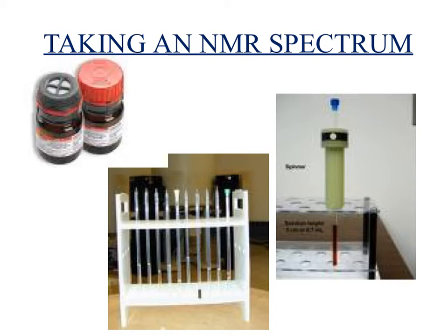Hi Year 14, the first thing that we have got to do before we talk any more about NMR is get the sample that we want to run in the NMR machine ready. Now if you look at the middle image there, you'll see that there are lots of little long tubes, and this is what the sample is placed into. Now before it's put into the little tube, it's dissolved in a deuterated solvent, and into that little tube then, as well as the sample, we will add a standard.